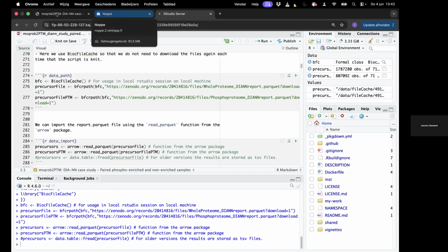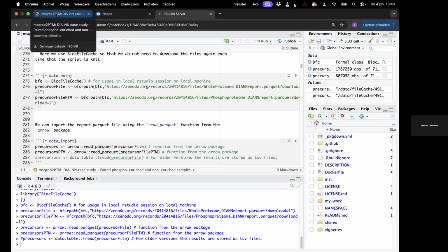So the use of Parquet is just this convention that they use, and that seems to be a very efficient way to compress the files. You don't have HDF5, for example. Probably it could work, but Parquet is what the two leading platforms now use. You can export it in the two platforms' formats, but most people nowadays use these Parquet files. Yes.